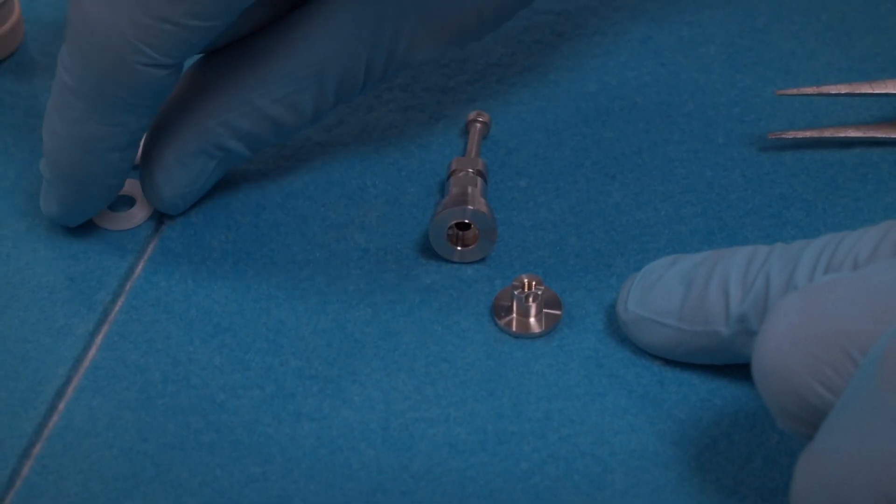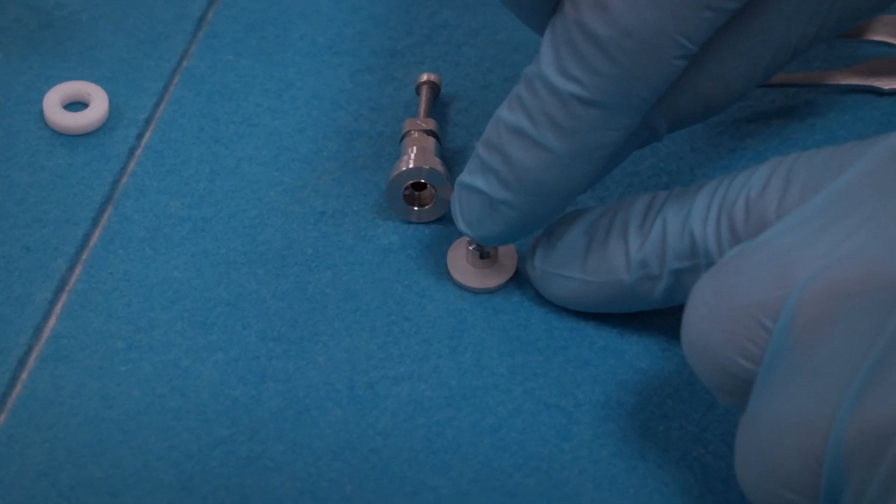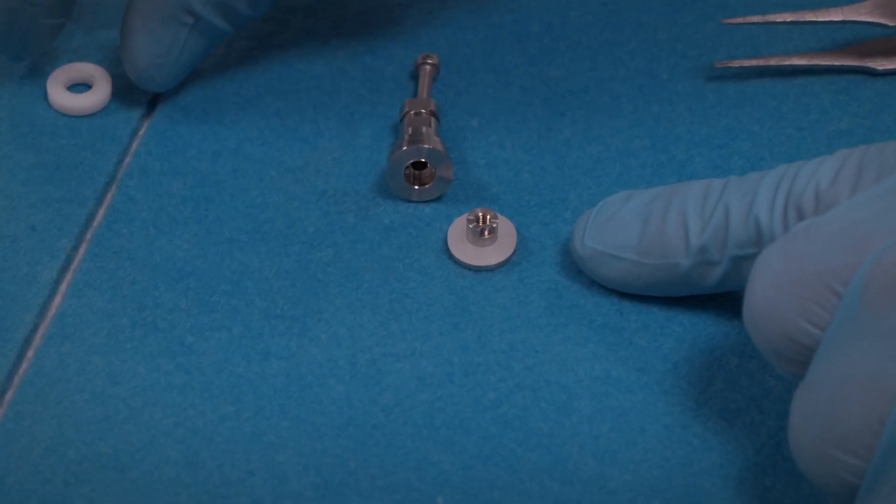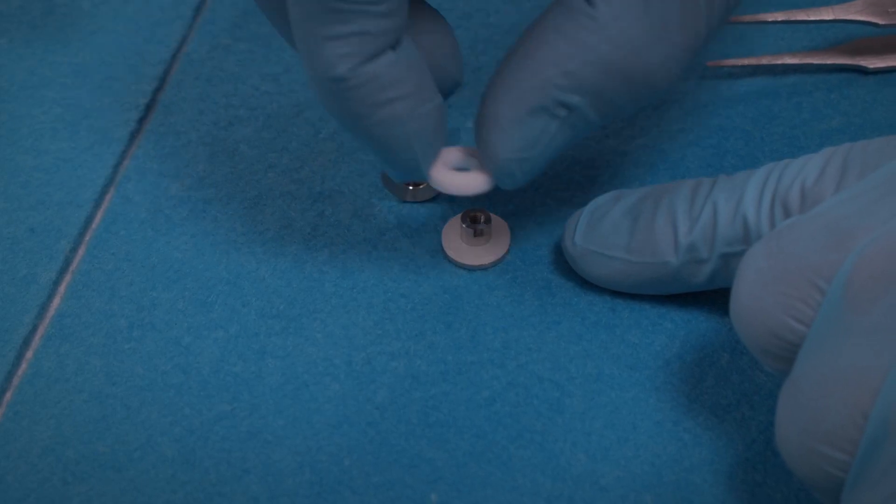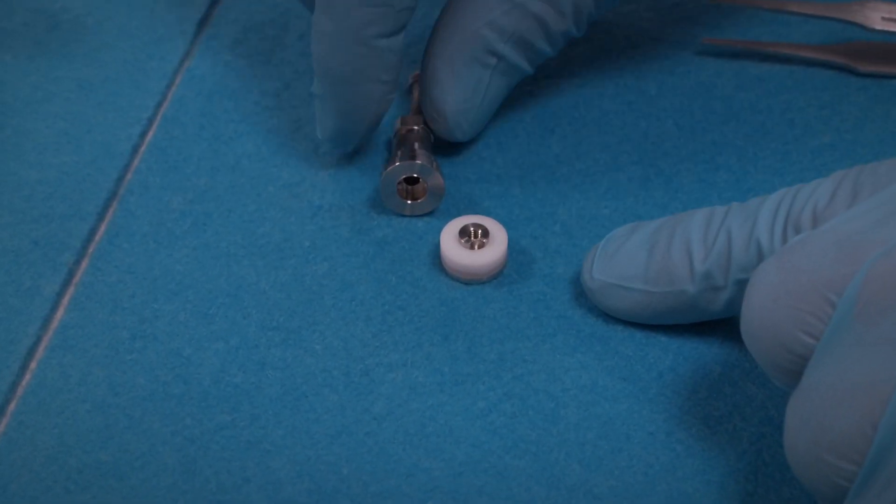The two sealing rings are curved and they have to be placed so that the curvature is pointing up. First the polyethylene seal, then the PTFE seal with the same orientation.